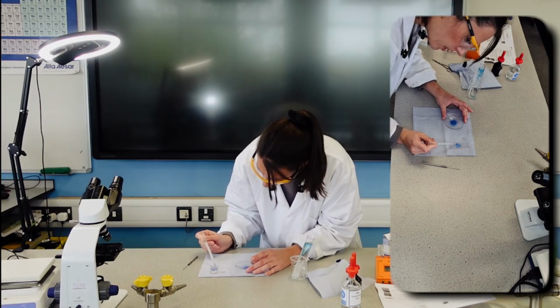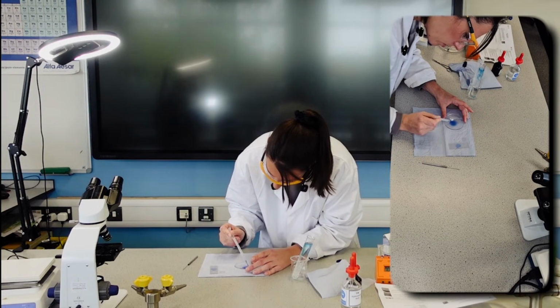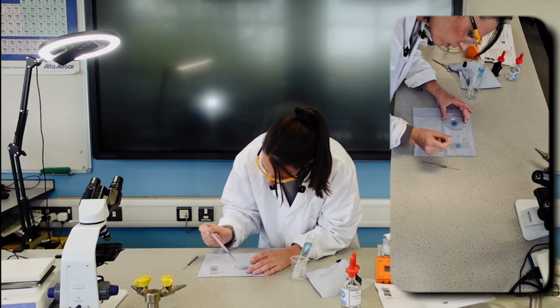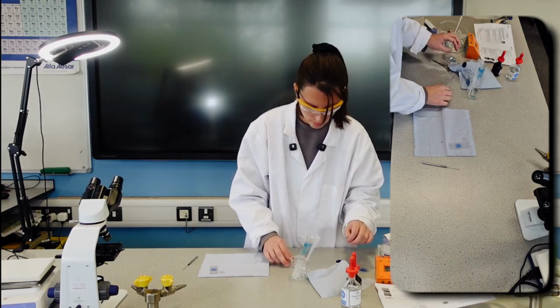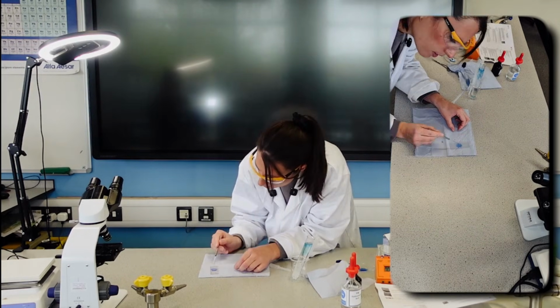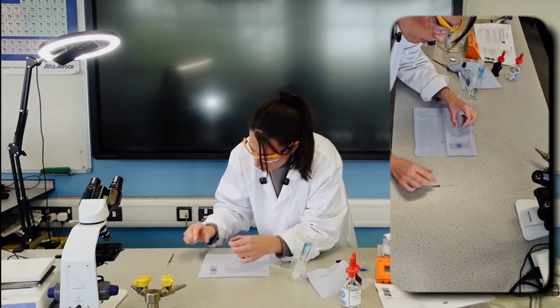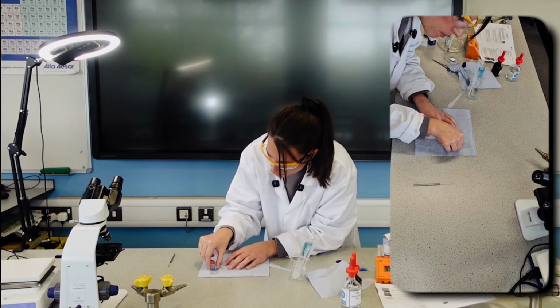Just going to get some of that excess liquid. And there's some more root tip. And then I'm going to move, this is like my main root tip that I'm going to aim to see. So use my mounted needle, just position that there. Place the cover slip on top.